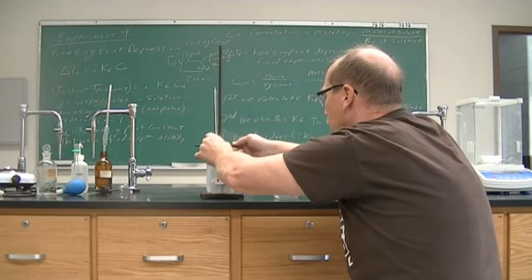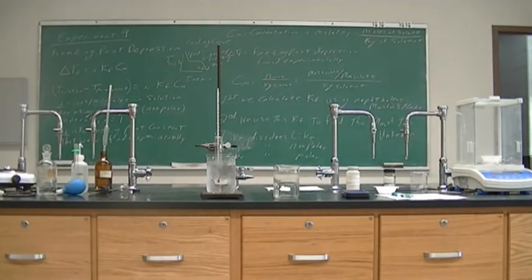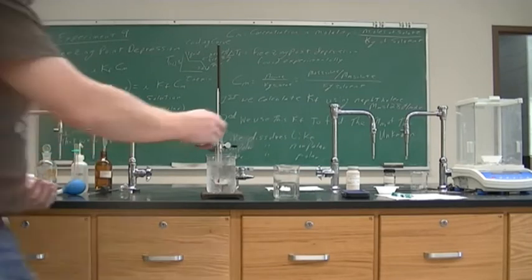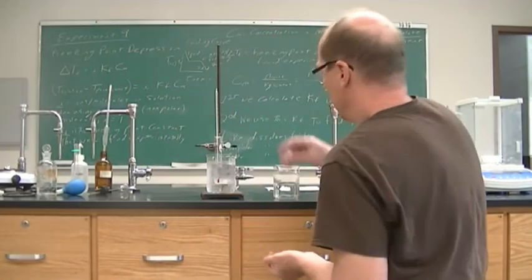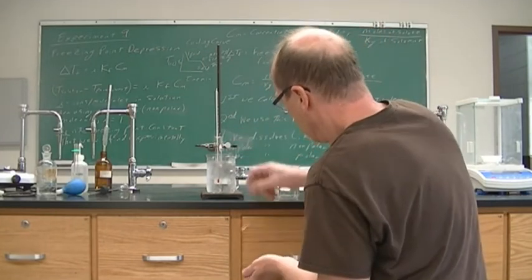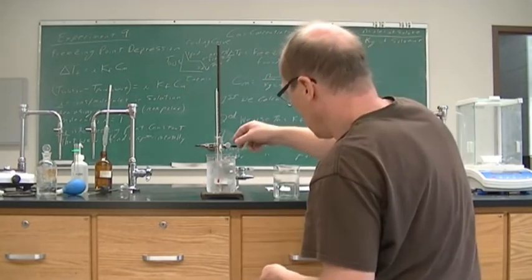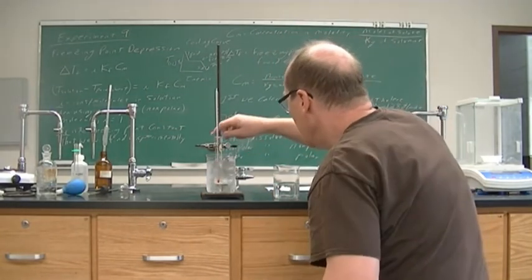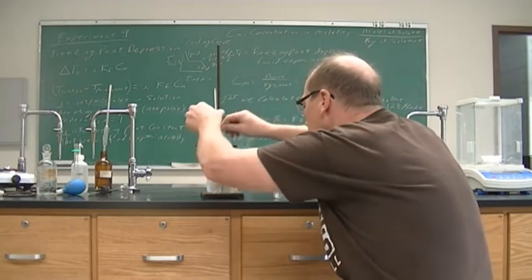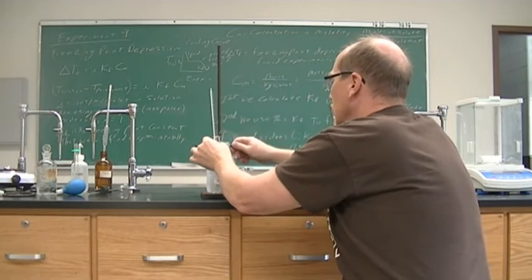Add some more ice in here. Make sure it has low enough temperature. At it.